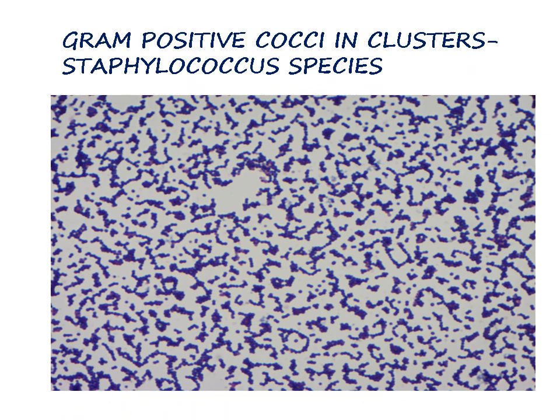So what organism is this? What is the morphology of this organism? Here you can see there are purple colored circles, that is the cocci. This is not elongated, this is not bacilli, this is cocci form. So this is purple colored cocci, you call it gram positive cocci. And what is the arrangement? We need to tell the morphology in terms of arrangement also. It is arranged in the form of clusters, grape like clusters you see. So this is gram positive cocci in clusters, so we call it Staphylococcus species.